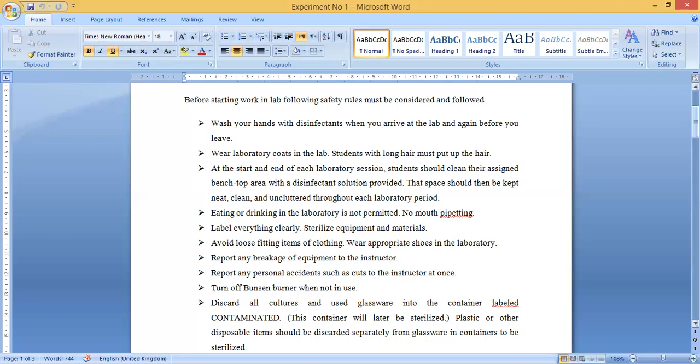Wear appropriate shoes in the laboratory. You must put on proper closed shoes — boots should be worn. No open sandals or fancy shoes are allowed. In case of any hazard, such as acid being spilled by mistake, you could get burns on your skin. For safety, your safety shoes must be worn at all times.